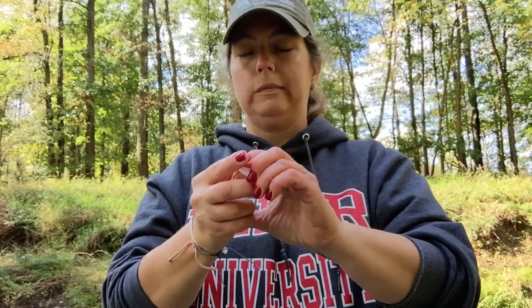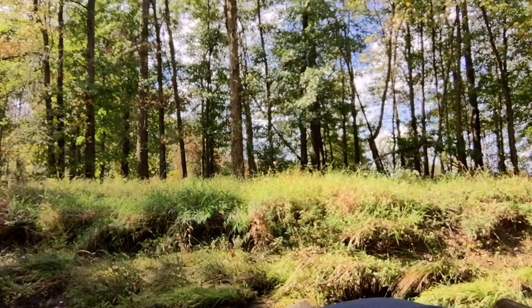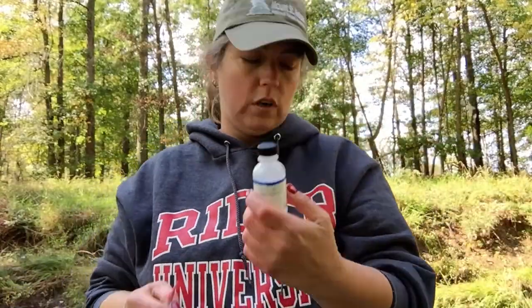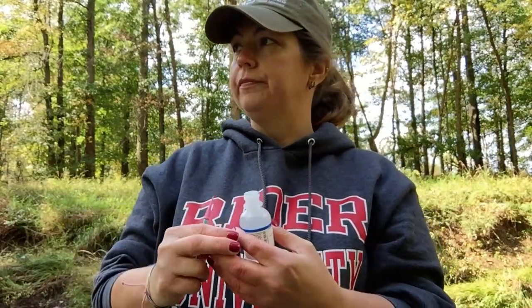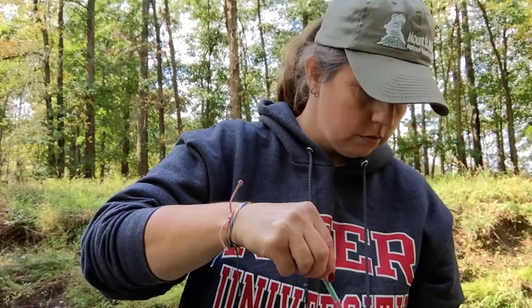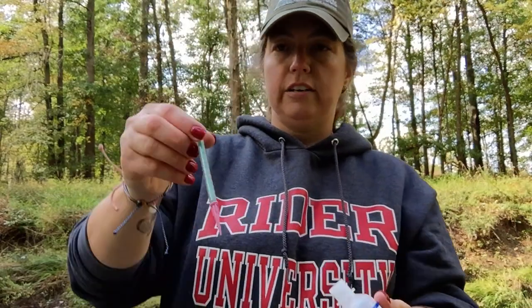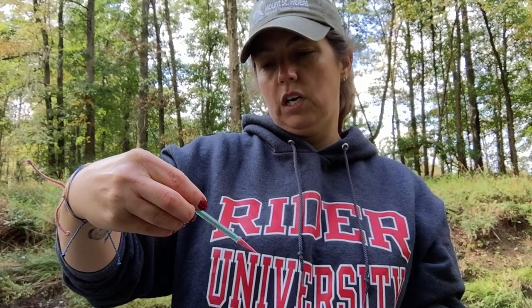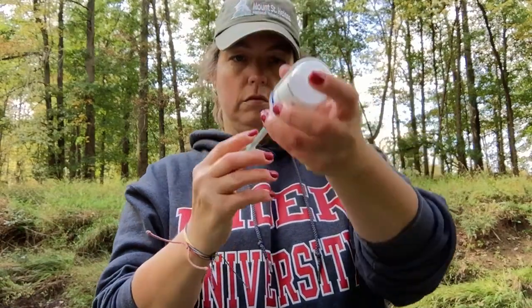Put the cap back on because I'm going to need to titrate. I have to fill the titrator just like before, but in this case I'm using the alkalinity titration reagent B. Instead of being zero to ten, the graduations are zero to two hundred, every twenty.